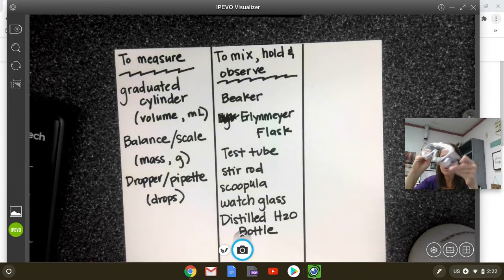Again, these are for safety. We don't have that really as a category, but I just want to make sure that we all knew what goggles are. They're nice because they fit right over your glasses. I'm a glasses wearer and I can also wear my goggles. Then you tighten it so that they fit to your face. And then you get this really awesome mark across your forehead so everyone knows that you were in science class for the day. So there's goggles.